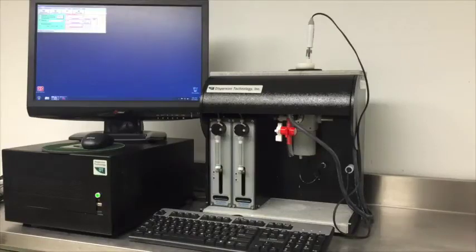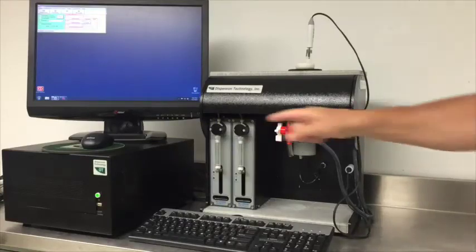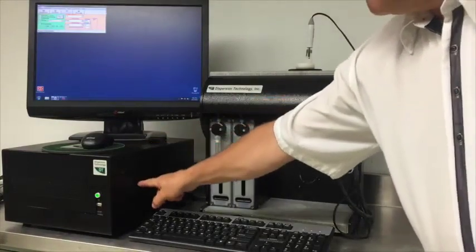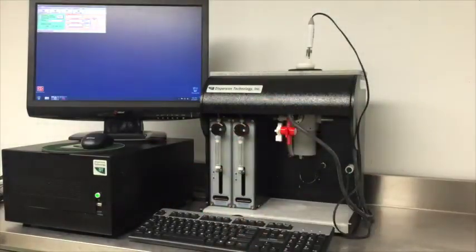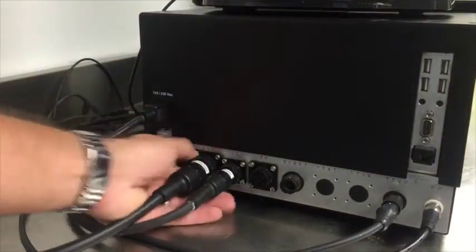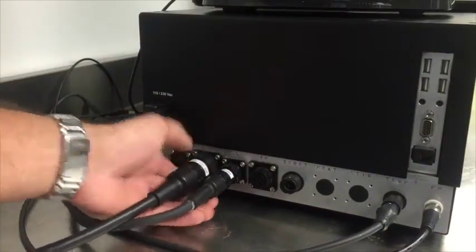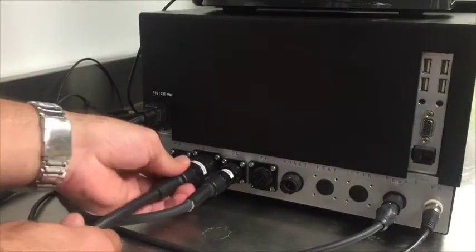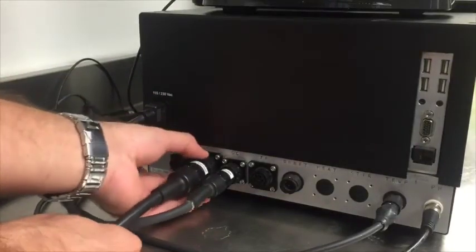This is our lab unit, which has been through years of use, so please disregard any wear or signs of aging. There is an electronics box that contains all electronic components, as well as the computer hardware and software used for conducting all of the measurements. The back panel of the electronics box has a set of outlets for connecting the cables of various probes that are placed into the measuring unit stand. Each outlet and cable are unique, which eliminates the possibility of plugging the wrong cable into the wrong outlet.